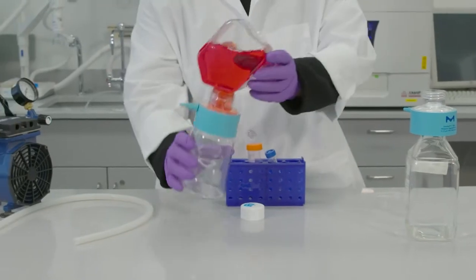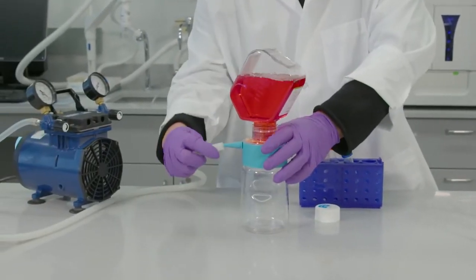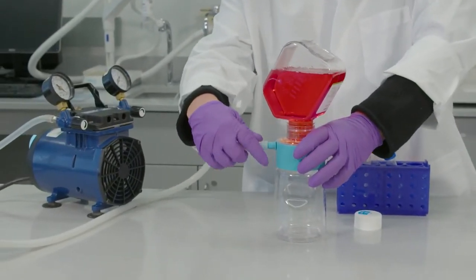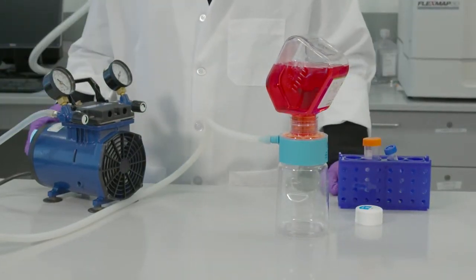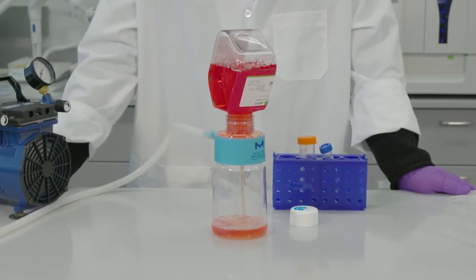Invert the assembly and attach one end of the vacuum tubing to the system and the other end to a vacuum source. Apply vacuum until filtration is complete.